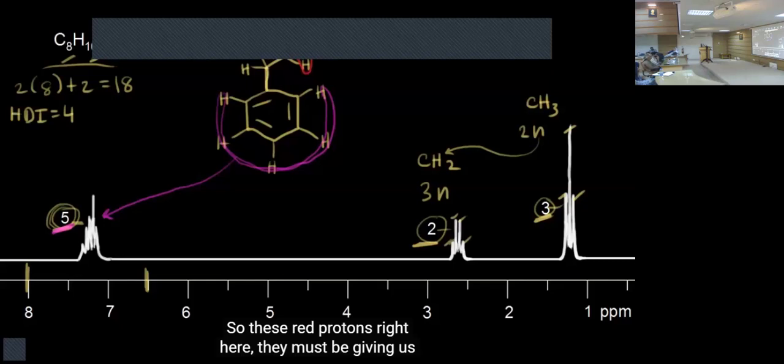And then, looking at this, because you have some concept, some knowledge of the previous literature, you can decide if they consider something as a 1 proton and you think it's not the 1 proton, maybe an impurity. Sometimes they consider a silica peak.